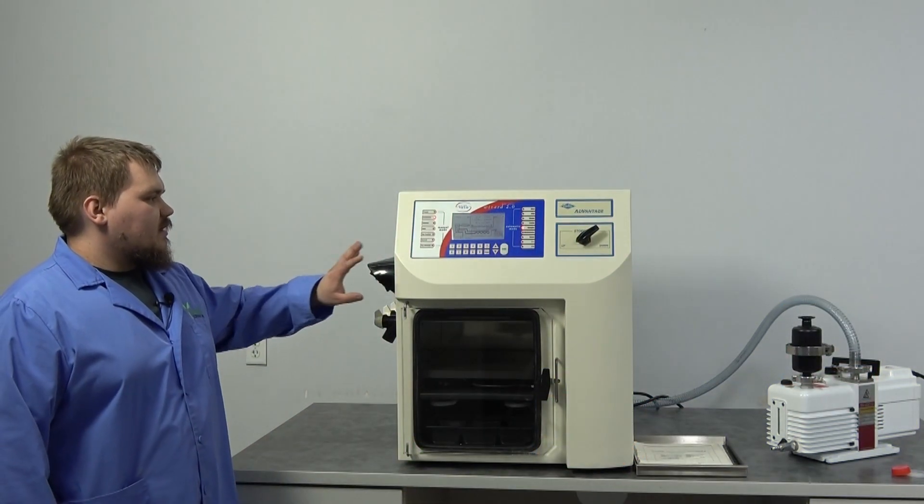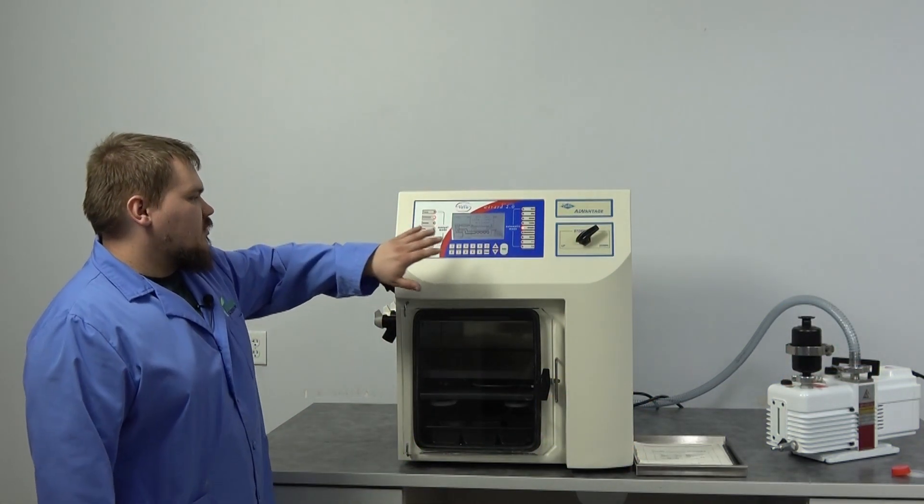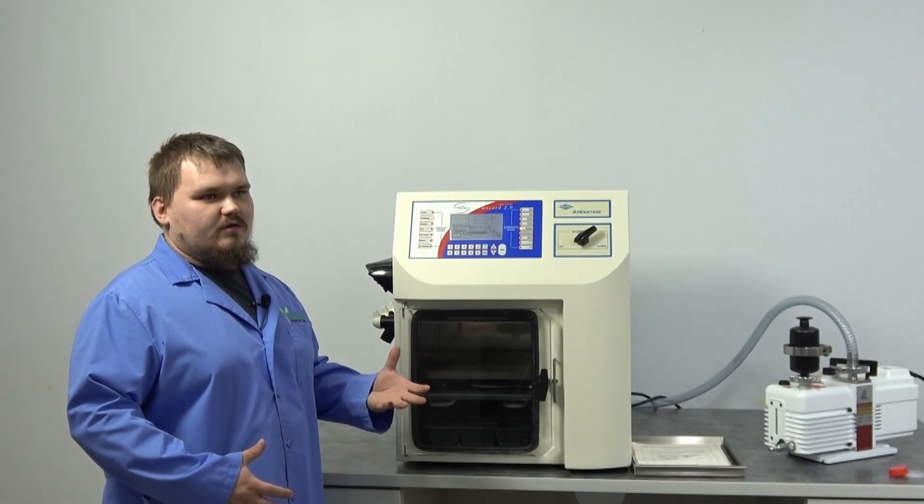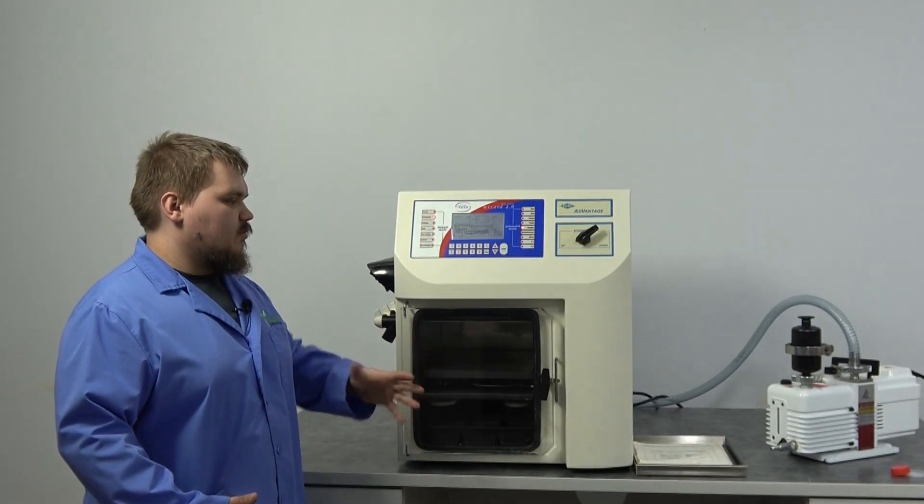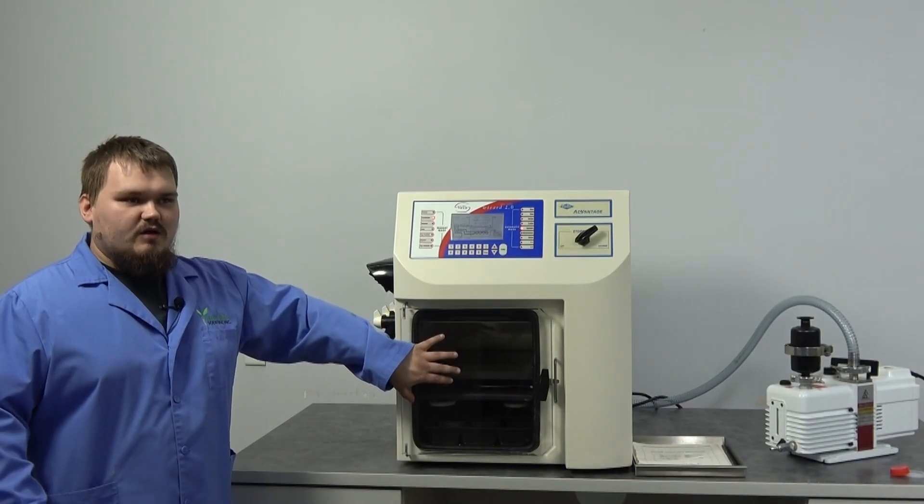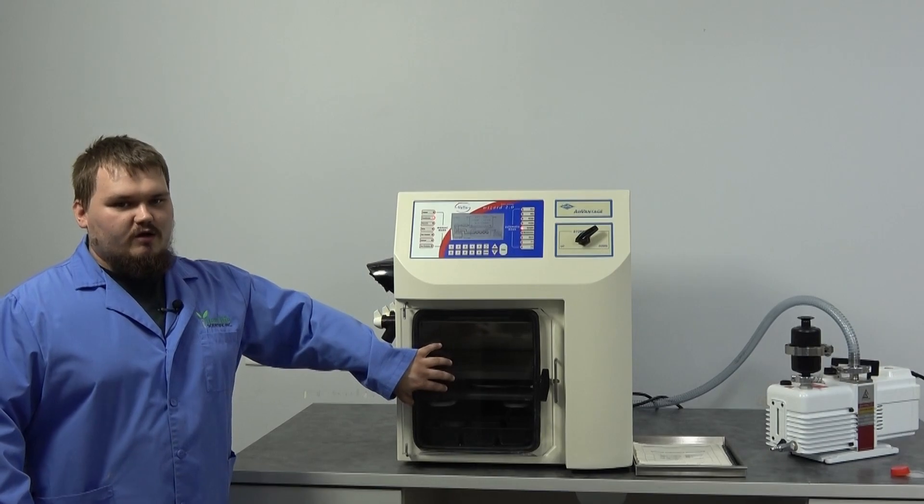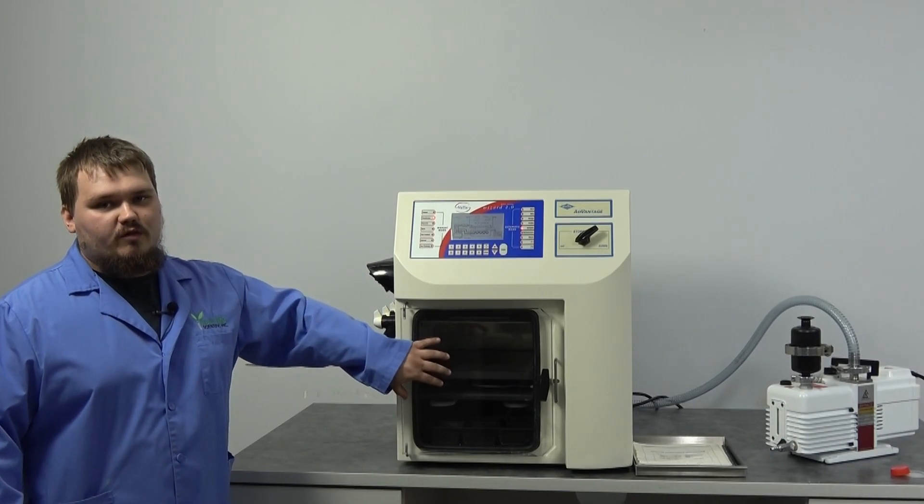Now that we're back from getting it down to temperature, you're going to notice that the machine didn't get quite down—it's a degree off. That is pretty normal with machines. Sometimes they can be a degree or two off, if not more, while it's not on any vacuum. That is perfectly normal.